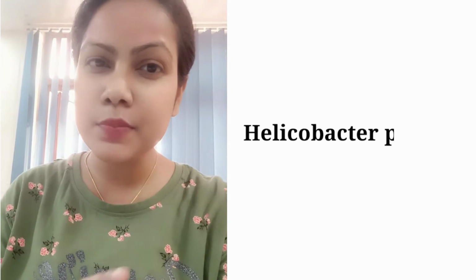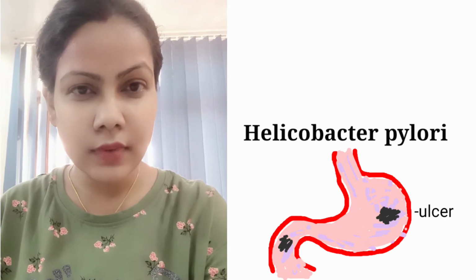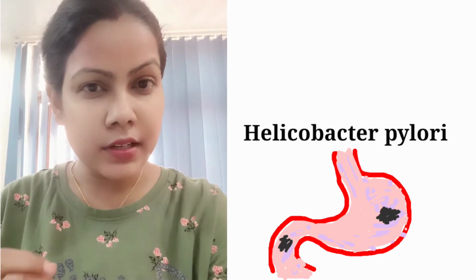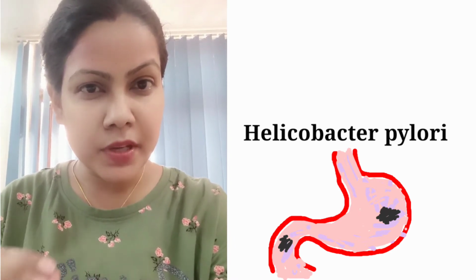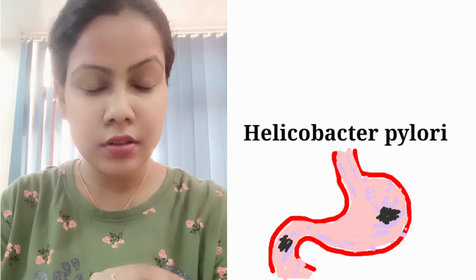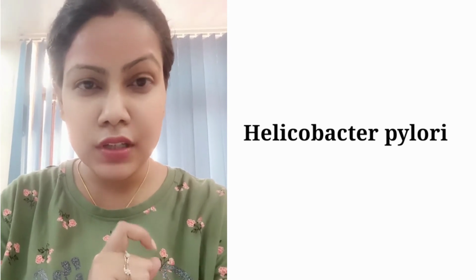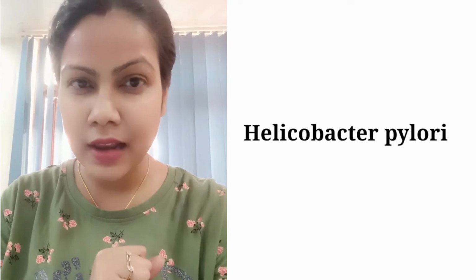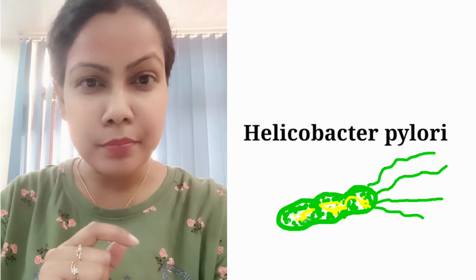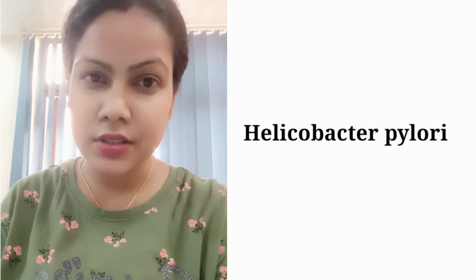For example, H. pylori infection. If a patient with peptic ulcer came and consulted a doctor and their biopsy specimen reached the laboratory, then for confirmation of whether it is H. pylori infection or not, we need to demonstrate the presence of flagella, because H. pylori is a flagellated bacteria, and H. pylori gives its biochemical test in a very variable fashion.